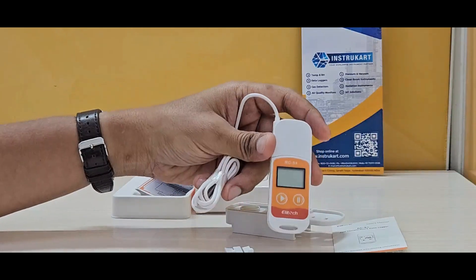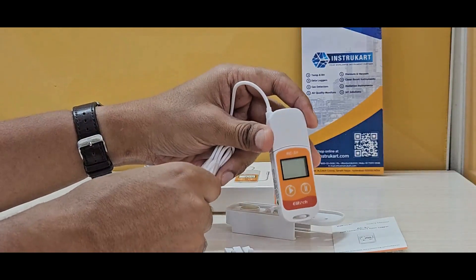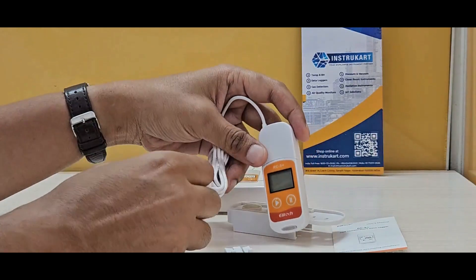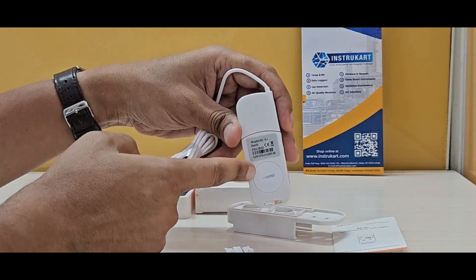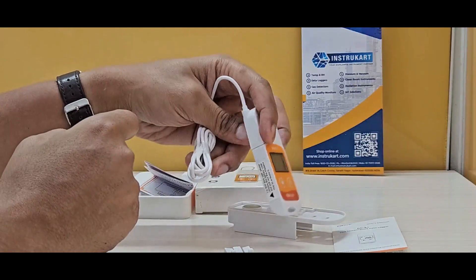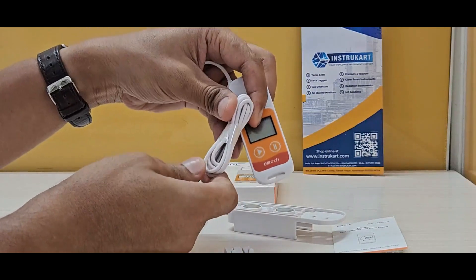It has a startup button, as you can see, and can be configured with the help of PC software. It uses a CR2032 lithium battery rated at 3 volts, and the internal sensor is an NTC thermal resistor.